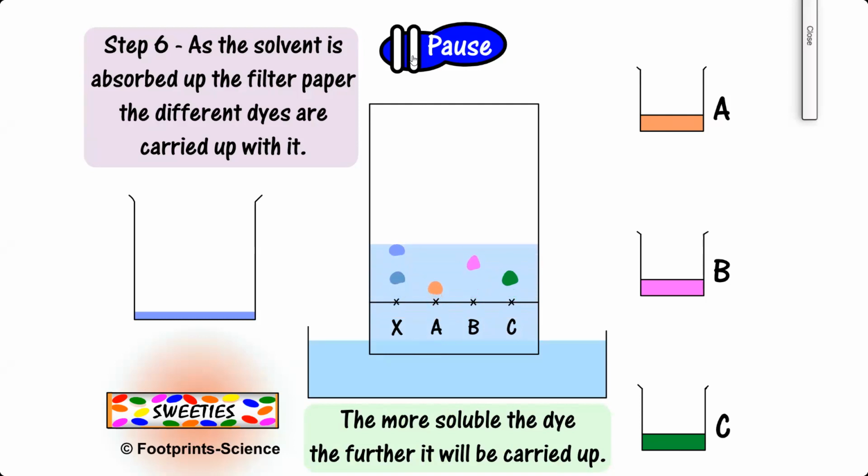So you can see how the dyes are moving upwards. That's because they're actually soluble in your solvent. Otherwise, they wouldn't have moved, okay? So, and I would like to stop here. Yeah, normally it was supposed to be designed so that this solvent stops here to really mark the solvent front, okay, but which is not the case, right?